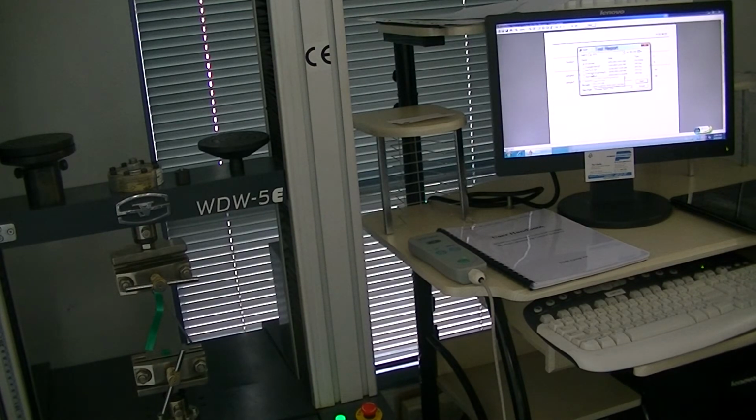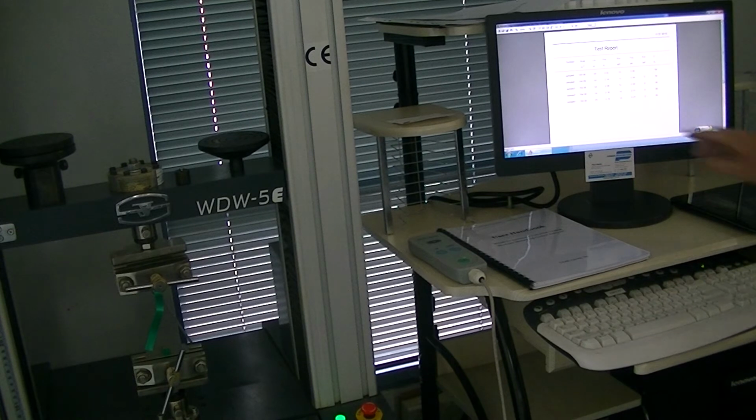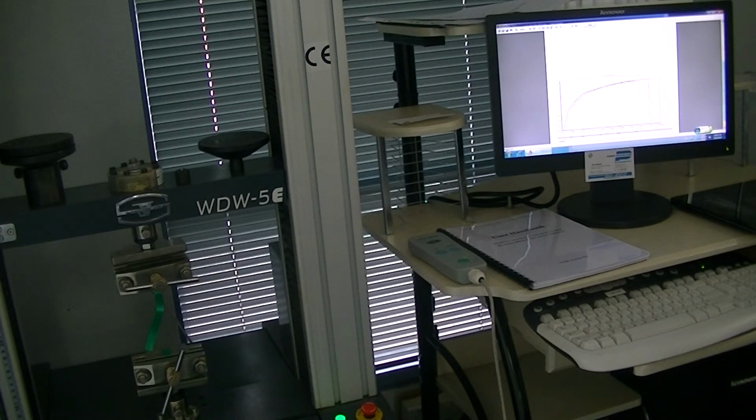Here we have a 5-run test, a previous test that we've done. You can see here now we have sample 1, 2, 3, 4, 5. This was done at another time, and we can see our 5 graphs down here. What we can then do, if you want to bring up that 2 sample that was done earlier on, which could have been done last year for effect, 2 sample test, and so forth.